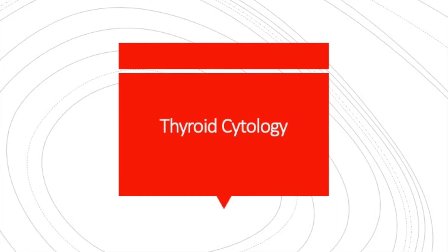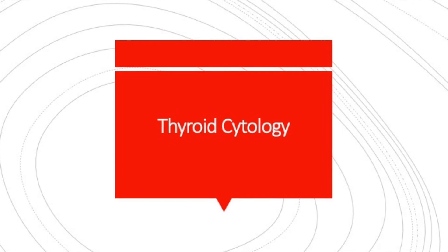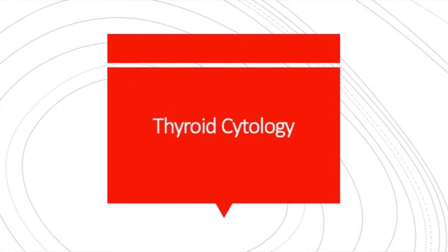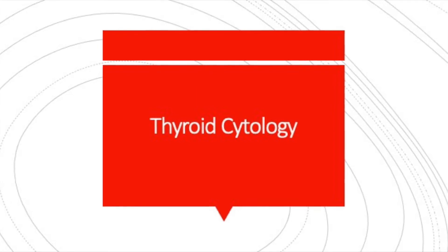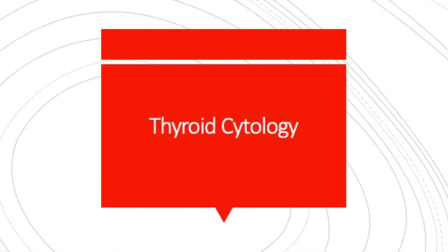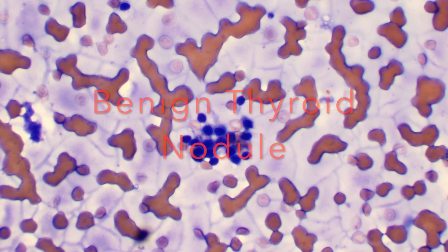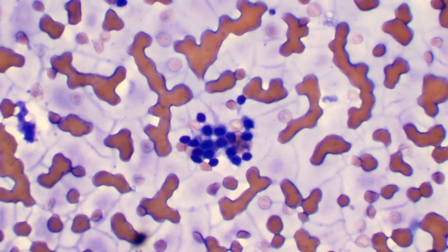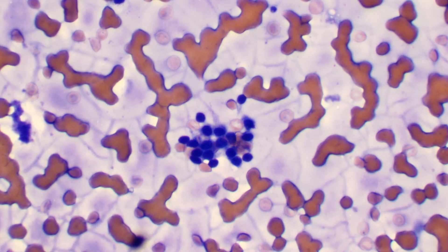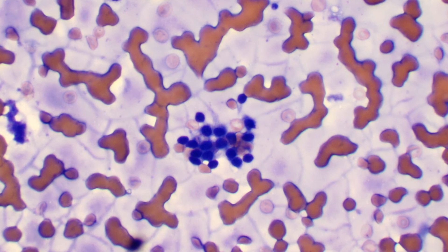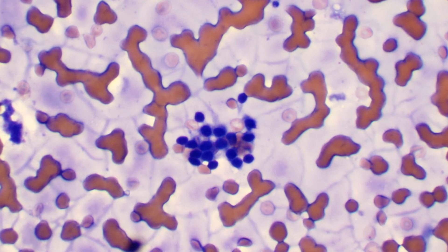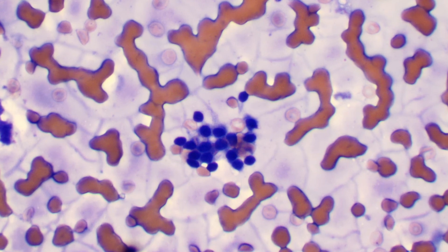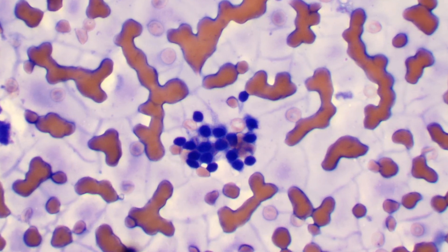Next we're going to look at some examples of cells from the thyroid. The thyroid is a very common organ for us to biopsy and look at in cytology because it is very common for patients to develop nodules in their thyroid gland — your butterfly-shaped organ found in your neck. This first example here is a group of follicular cells in the background of colloid. Follicular cells have small round nuclei with not much cytoplasm, and in the background we see colloid, which causes a cracking-like appearance and a purple color on the slide. This is a good indication that this thyroid nodule is most likely benign and can just be followed up by imaging in a year or so.